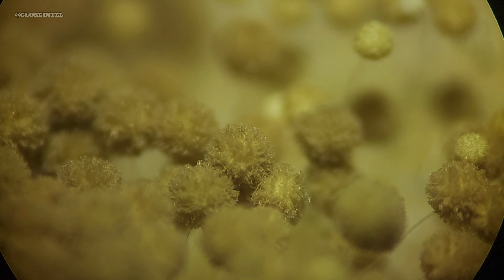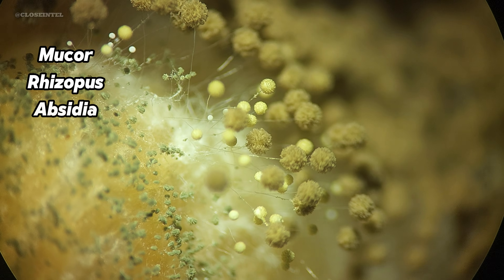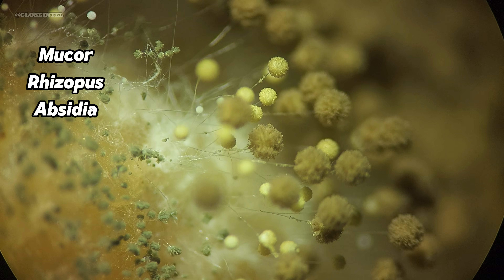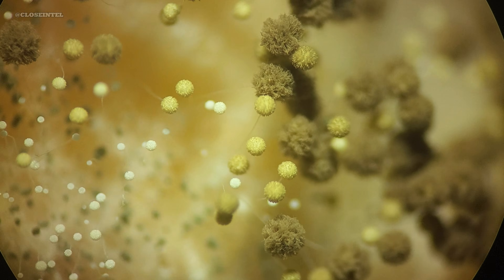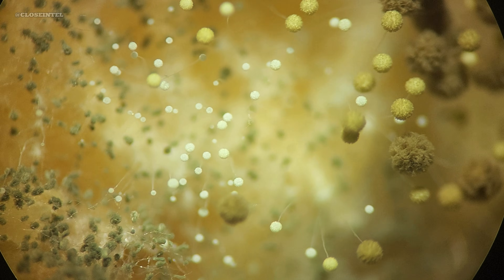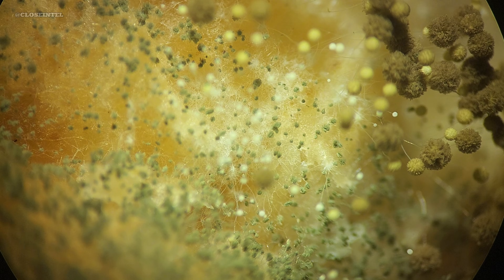The most common kinds of zygomycota molds that grow on bread are Mucor, Rhizopus, and Absidia, which all produce and release spores through their sporangia. You may have noticed that there are various different colored and sized sporangia, which could either indicate different species or the same species just in a different stage of its life.